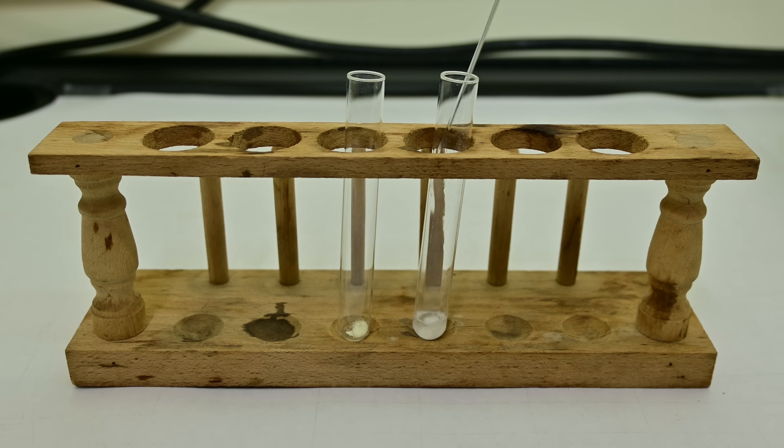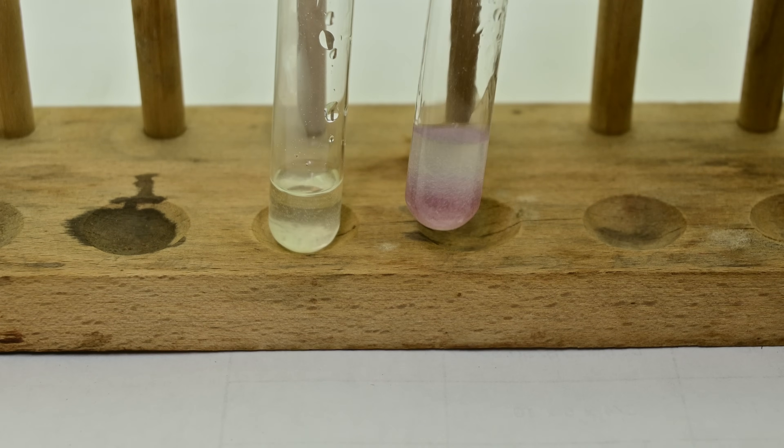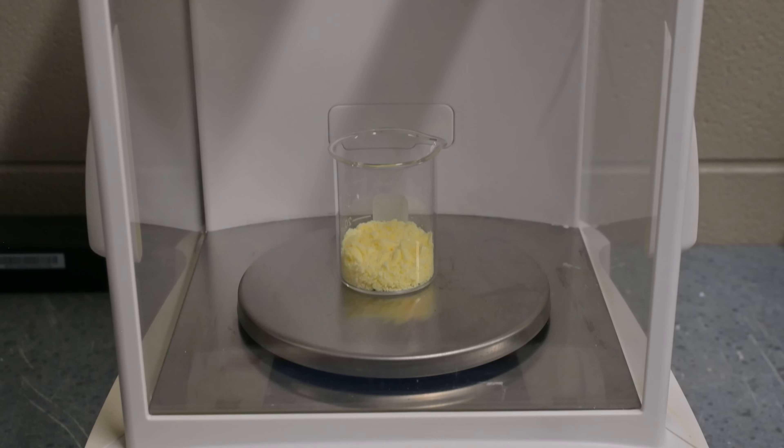To confirm our oxidation has fully went to completion, we can perform a simple test for residual benzoin. Take a few crystals of our benzil product and dissolve it into 1 milliliter of ethanol. We then add a single drop of sodium hydroxide solution. If any benzoin remains unoxidized, you'll see an immediate purple coloration. A clear solution, however, indicates that the oxidation was successful.